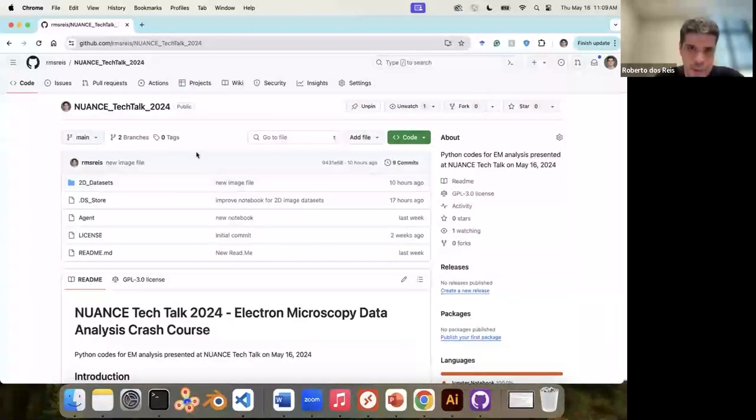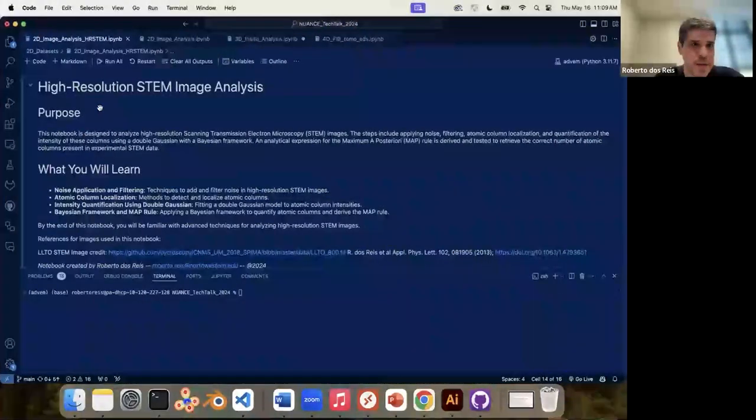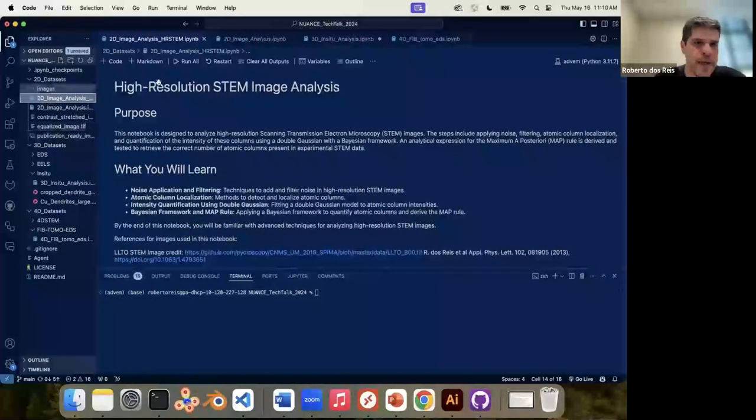So let's jump right in. I will control the time. I'll try not to spend too much time. So this is one way to do it, right? Everything here will be in Jupyter notebooks, so you can open a Jupyter notebook on whatever platform you use. I am particularly using VS Code here. I have my codes here on the side, and I have everything in my folder.